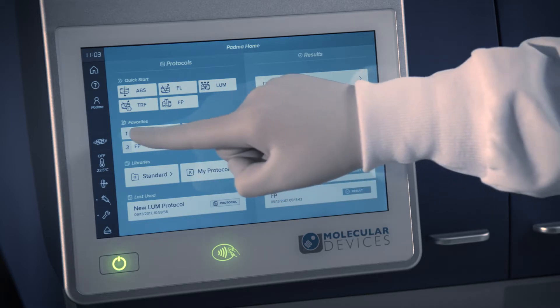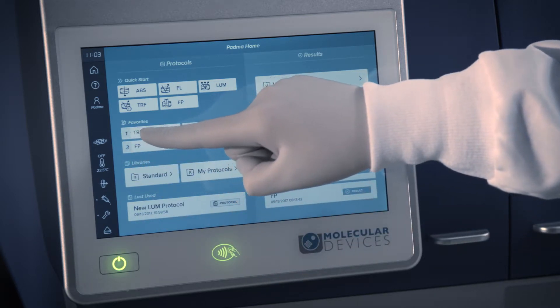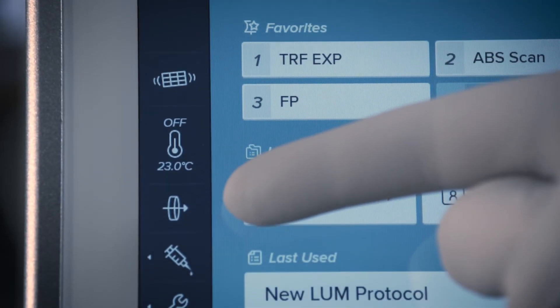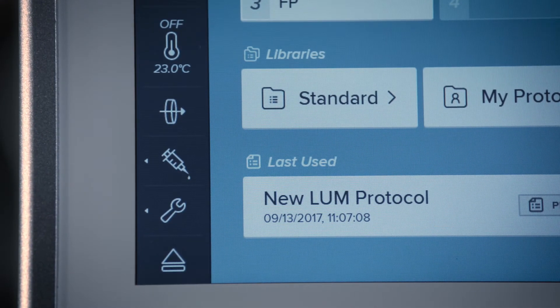Special reader functions that can be controlled from the home page are located in the lower left-hand corner of the screen. These functions include plate shaking, temperature control, filter settings for the ID5 instrument, and injector maintenance for washing, priming, and calibrating your injectors.